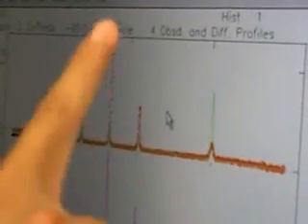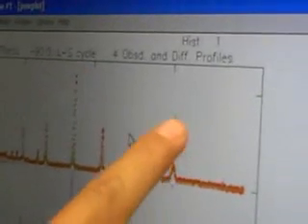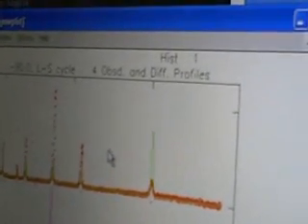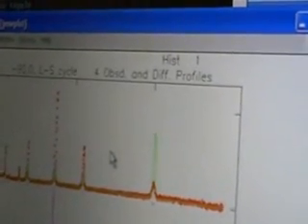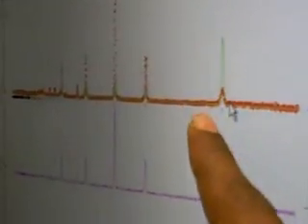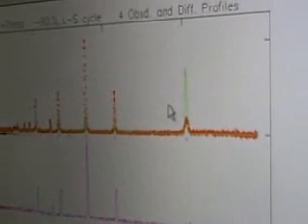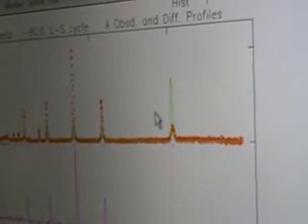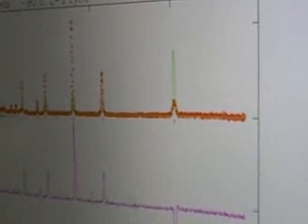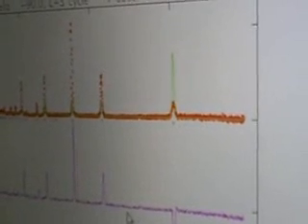Raw curve with a cross, this one is a refined curve, green one, this is a difference curve. What exactly is a difference curve? A difference curve is just this guy minus this guy. So this was the raw? Raw data in cross. From the detector? From the detector. And this is the refined one? Green is the refinement, continuous line. So what is it saying now? Why is there a difference? Because we didn't refine, we just provided the most basic input. We didn't refine texture, we didn't input stress factor, what is internal stress, we didn't give anything. So that's why the difference is this much. How you can tell whether it's a good one from this curve? When it is flat. Yes.